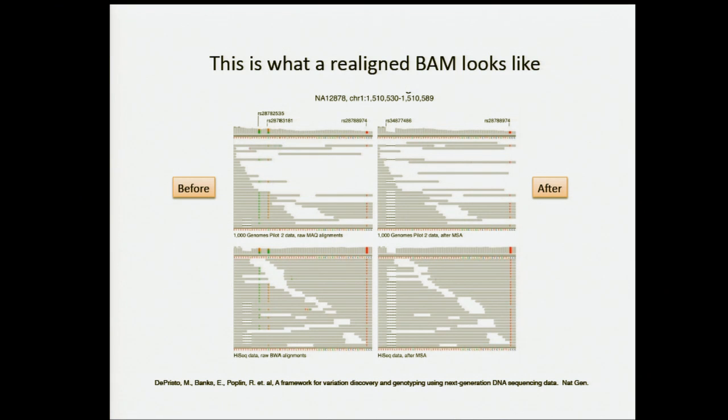So why is this an extra cool screenshot? Because every single one of these variants, the deletion and all three SNPs, are present in dbSNP, our catalog of known variants. So you ask me, well, what does that mean? How could it possibly be? You just told me these are artifacts. Well, that's the problem with dbSNP. People submit to dbSNP, and sometimes they submit errors. They haven't done their realignment. They didn't do the right workflow, and they've submitted known variants that are actually not really true variants to dbSNP.